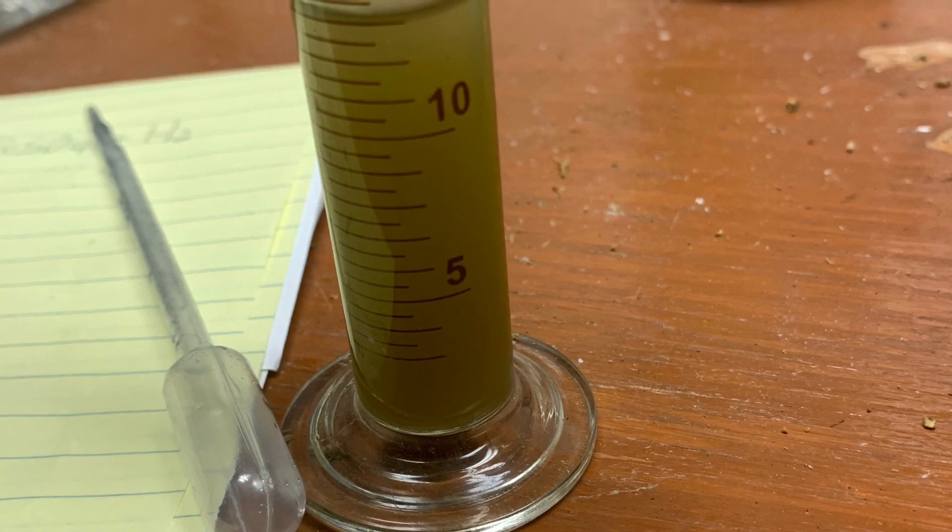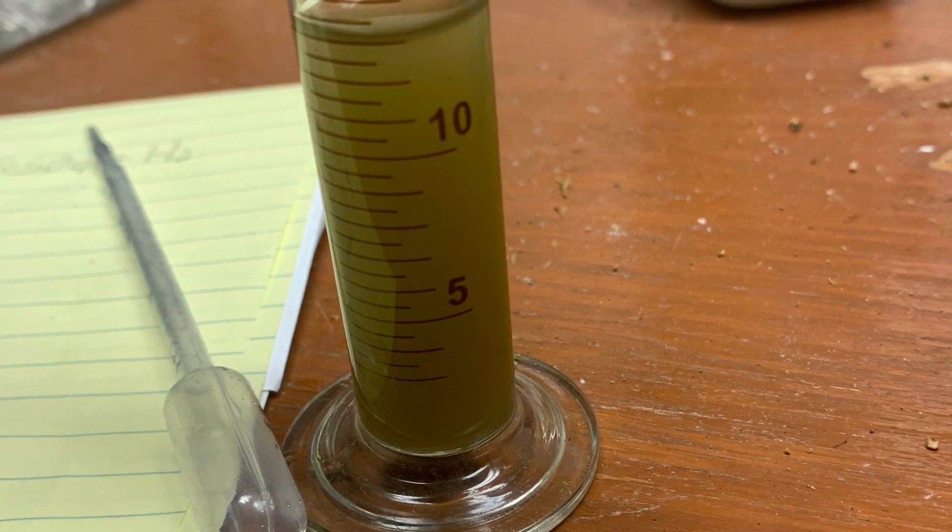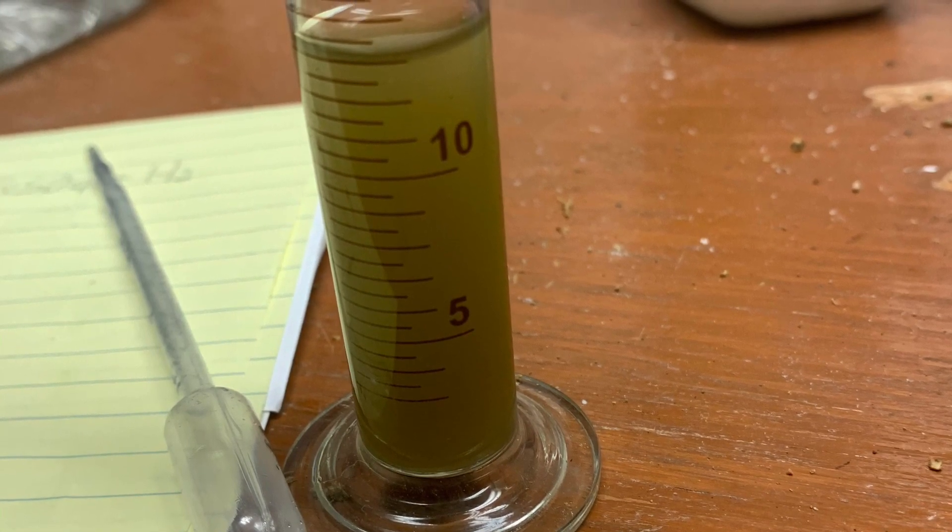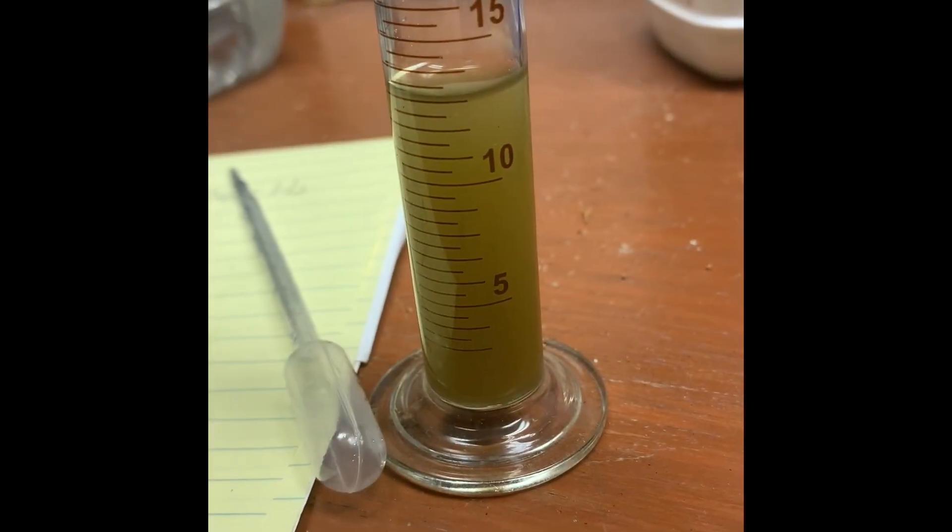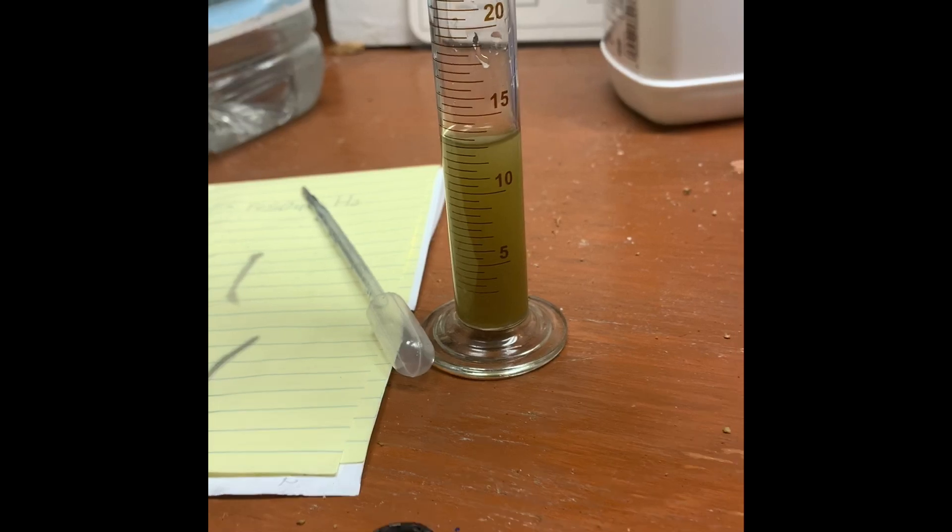Then we directly filter the solution into this graduated cylinder. As you can see here, it's starting to turn a bit yellowish, and this is indicative of the plus three oxidation state.